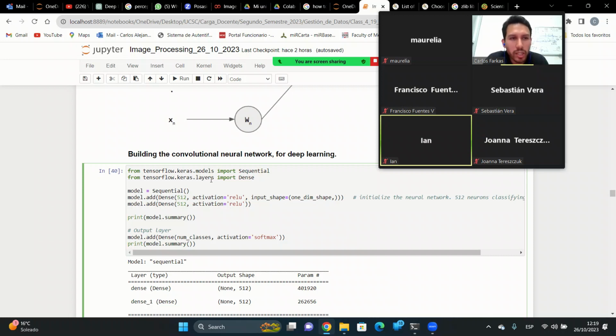But some convolutional neural networks come with more layers and decrease the number of neurons, and end up at the end with two neurons classifying yes or no, binary decisions. Basically it's a very dense layer, and then it goes through several layers of hidden neurons, and then we end up with two neurons or four neurons classifying if a pixel belongs to a number or its background, or it belongs to a certain number.